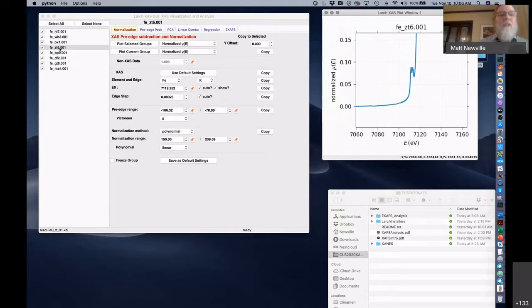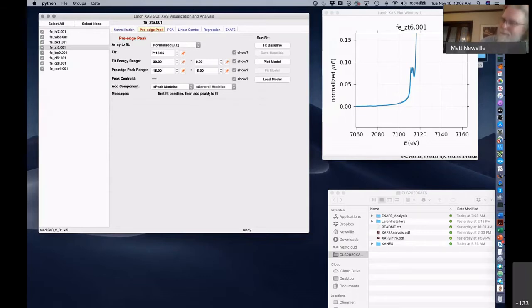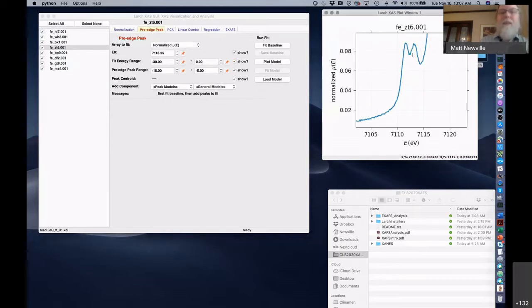So you saw that there was a variation in these pre-edge peaks as it becomes more reduced or oxidized. One classic way to analyze XANES data, especially iron and other transition metal oxides, is to do a pre-edge peak fitting. Let's fit those peaks to known line shapes and get their intensities or the centroid, because that can directly scale to oxidation state.